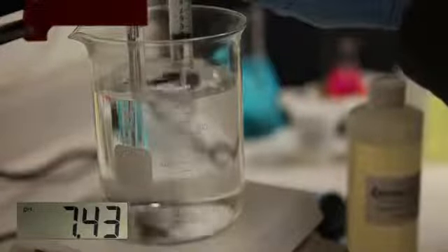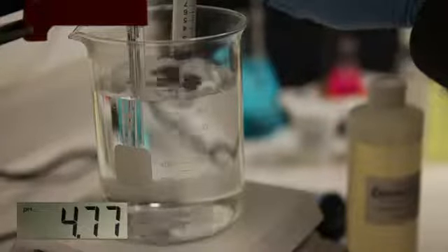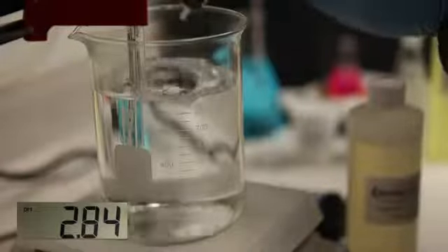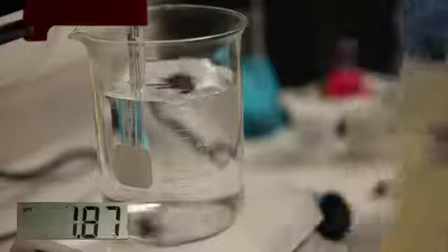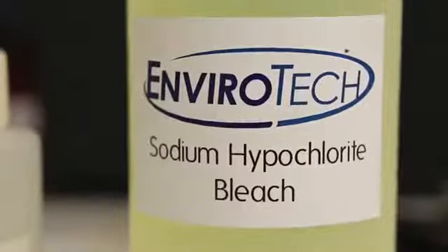That syringe is a little jammed. It is not dispensing very smoothly. Next comes the sodium hypochlorite bleach.